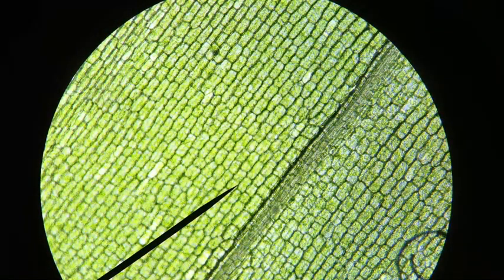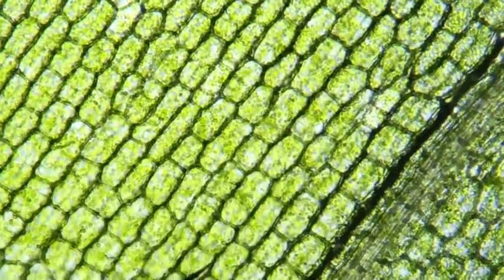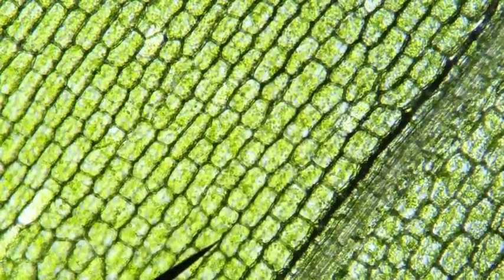I'm going to switch to medium power. Under medium power I can start to see some of the chloroplasts — all the smaller green circles within the cells. Turning the fine focus, I can kind of zoom in on a few of them. I can't get them all zoomed in at once and there's more than one cell layer here.